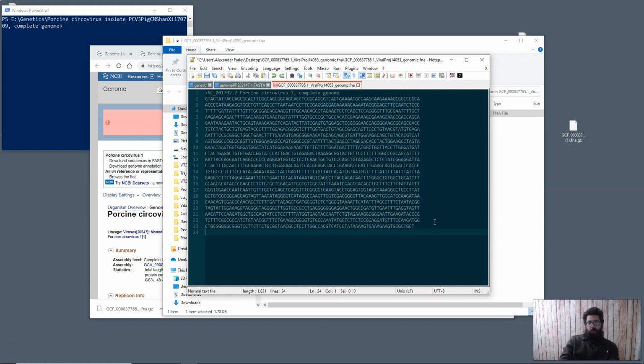Okay, so what do you do with that? Basically, there is a codon or set of codons that tends to start an open reading frame. And I say tends because that's not a 100% guaranteed relationship, and it's a little bit complex in reality which codons actually start an open reading frame. So essentially what I'm going to be doing in this script is producing candidates. What I mean by that is I believe that the output of this script will include all of the proteins which could be produced and possibly more.